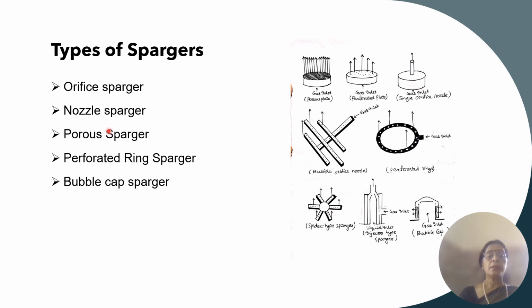There are different types of sparger, and the choice depends upon the operator or the objective of the operation. So many types of sparger are available.